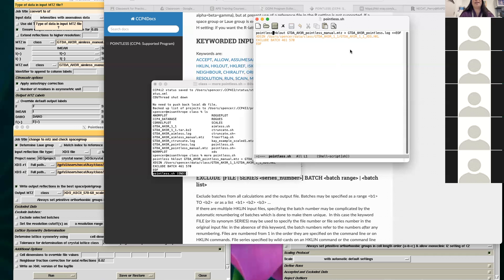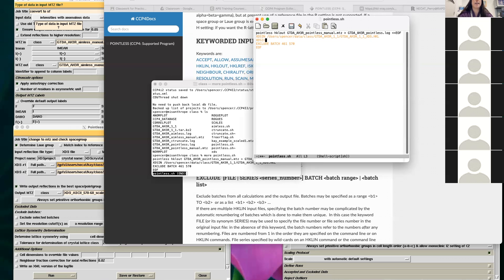If you have multiple files to combine, you just put them on separate lines — 'xds in' with each filename. So if I had four or five data files to combine, I'd just list them sequentially. There are also keywords that let you do other things, like excluding bad images. There are two ways to handle bad images: you can either re-process as separate wedges, or use an exclude batch keyword.